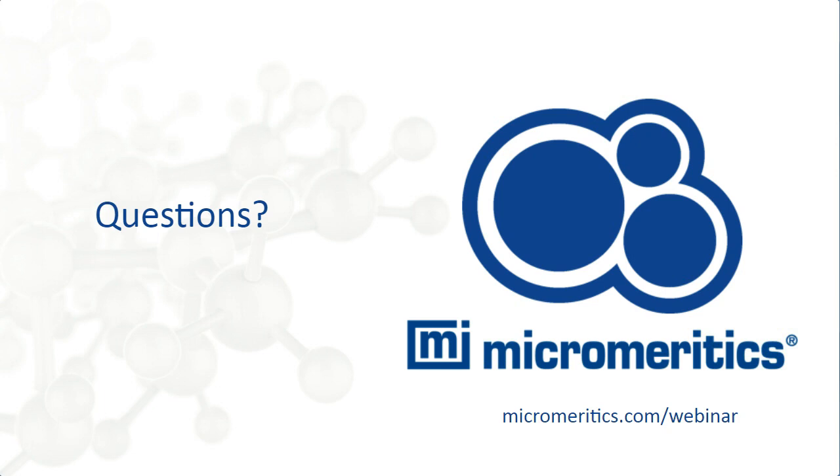Yeah, that goes in a similar direction to what I said about how many data points are recommended to be used. You find different opinions here. I know that some people say you should have at least 4 nines after the decimal point. My feeling and my experience is that sometimes the difference is not that huge, depending on whether you have 3 or 4 or even 5 or 6 nines, so getting closer and closer to 1. This is what you read, aiming for at least those 5 nines. I don't know. Maybe you, with having even more experience, Jeff, have some additional advice to this question.